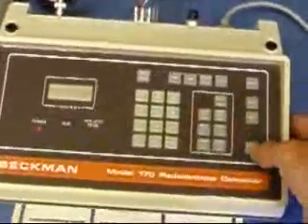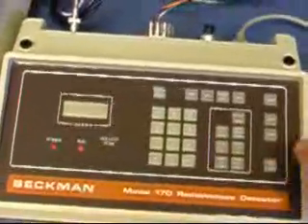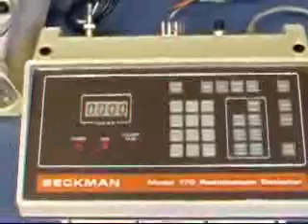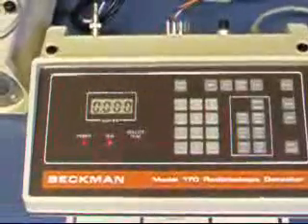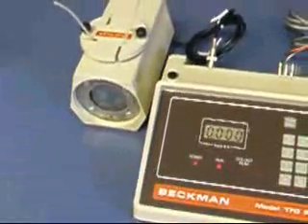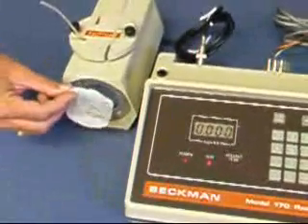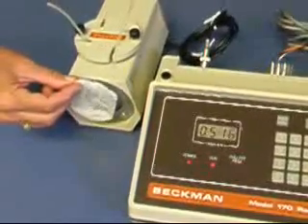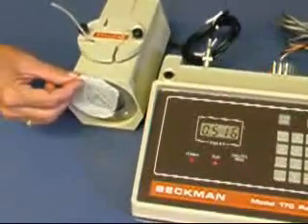There's also a manual count mode. Press the manual count mode. It's displaying at background level of counts. And when the radioactive source is placed in front, it immediately responds with high rates of count.